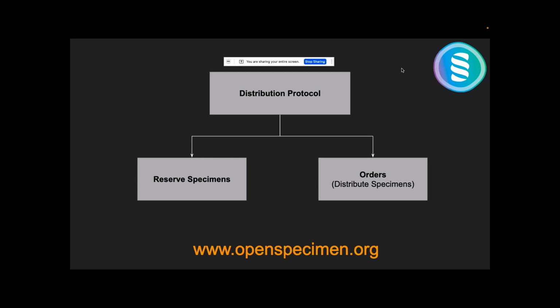In such cases, all the specimens that are supposed to be distributed can be reserved, so that no other person or technician mistakenly distributes those specimens. For that, you have an option called reserve. And an order is nothing but the actual distribution of specimens.